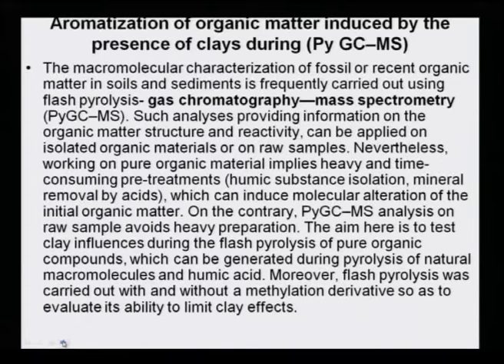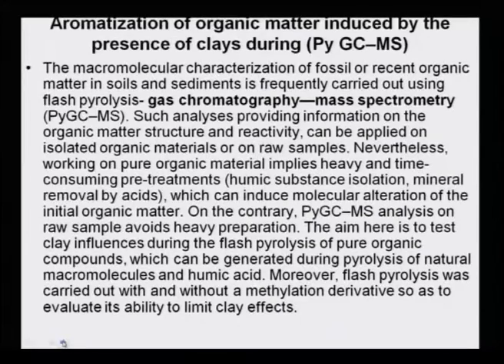Now, if all these procedures have to be carried out, it is bound to make differences in the original material. To avoid this, a new method, pyrolysis GC-MS, was introduced. On the contrary, the Py-GC-MS analysis on the raw sample avoids heavy and difficult preparation.